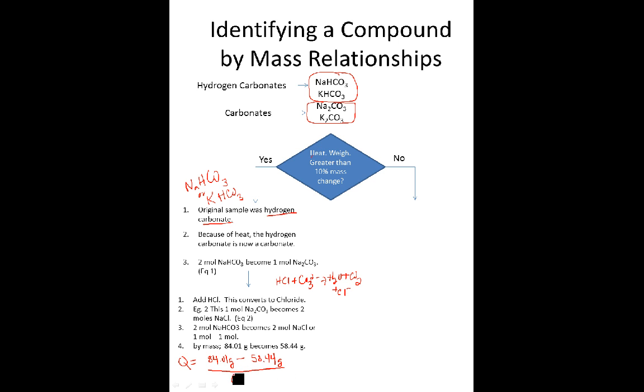Then I divide it by the original weight. This number will look different for the sodium salt versus a Q that you would get if you did it with the potassium salt. They'll give you different numbers. If you're using potassium, then these numbers here will change, and you must go through and figure out what those might be in theory. Okay?